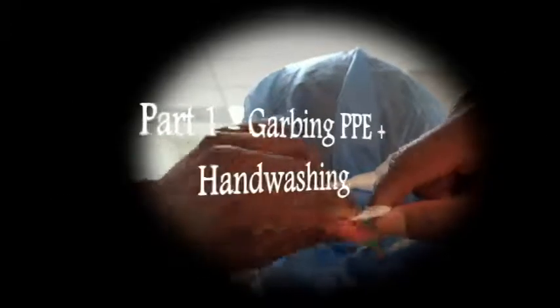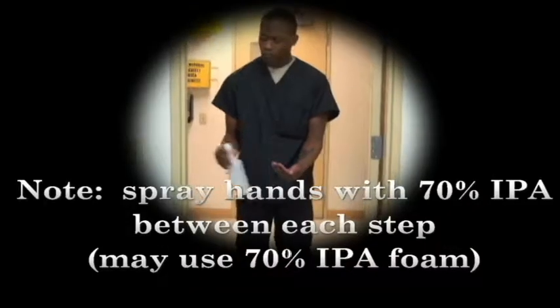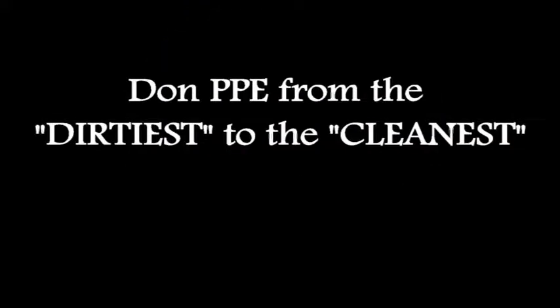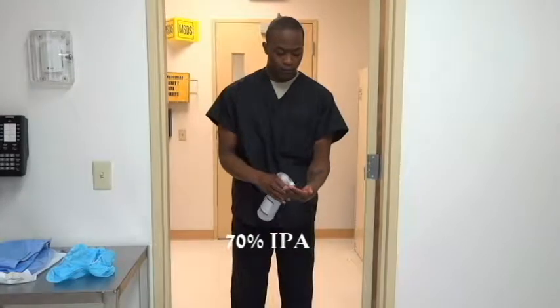The following are procedures on how to properly garb and perform hand washing. Spray hands with 70% IPA between each step. Don PPE from the dirtiest to the cleanest. Sanitize hands with 70% IPA.